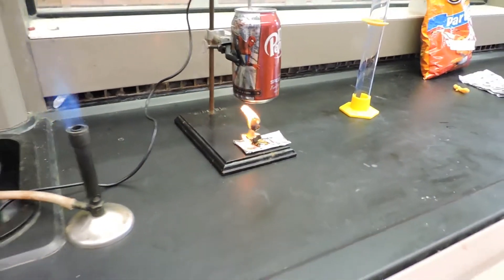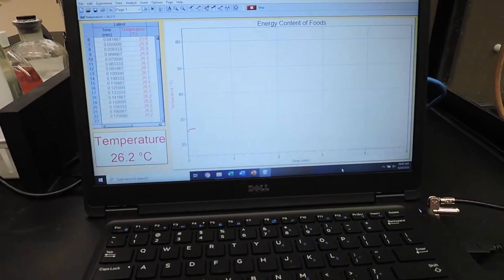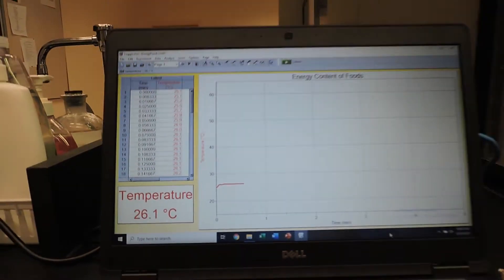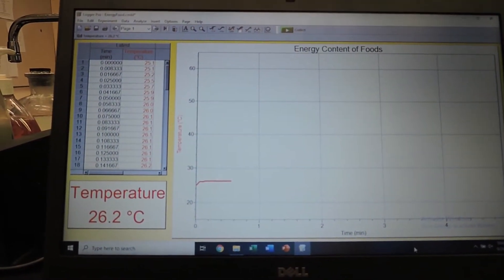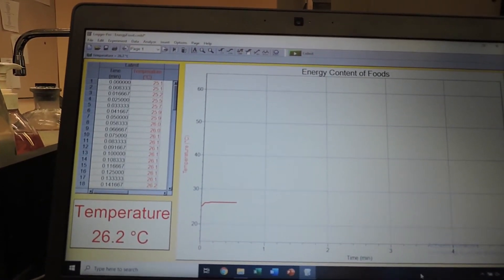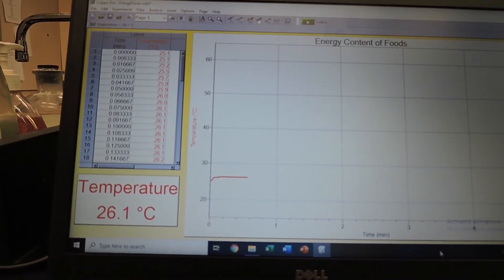While this is burning, we have started the temperature record on Logger Pro. Now the temperature has stabilized, so we have stopped data collection. We will write down the final temperature on the board, which is 26.1 degrees Celsius.